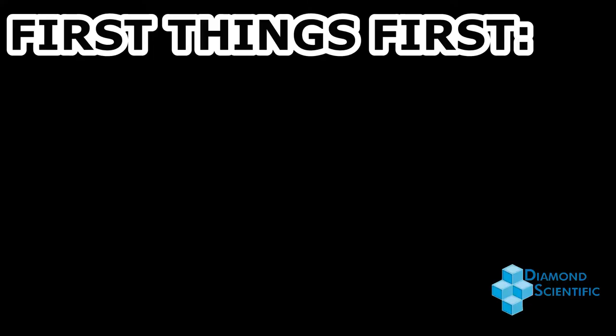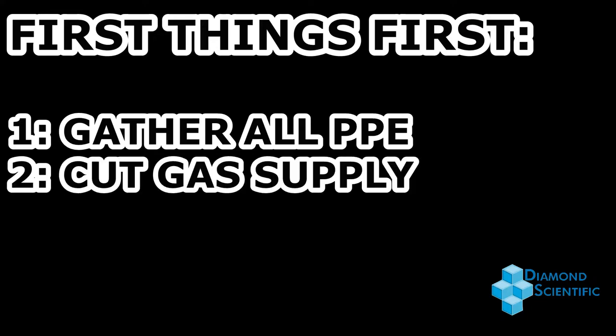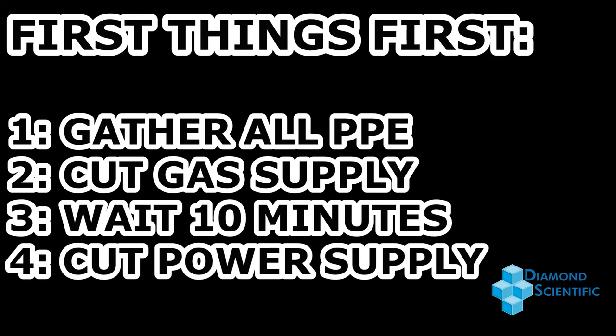First, whenever performing maintenance on the SWG 100, gather all appropriate personal protective equipment. Then cut off the gas supply, allow 10 minutes for a full gas purge cycle to complete, before completely cutting power to the analyzer.